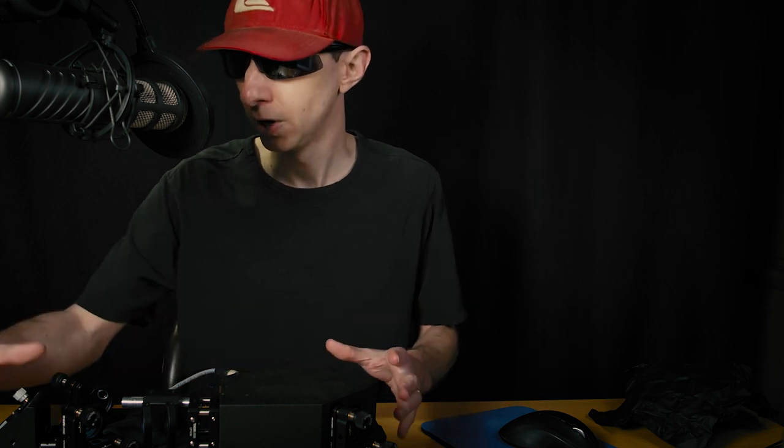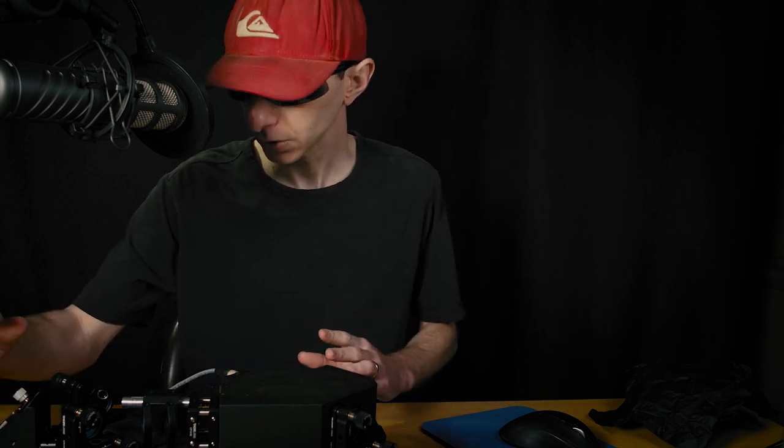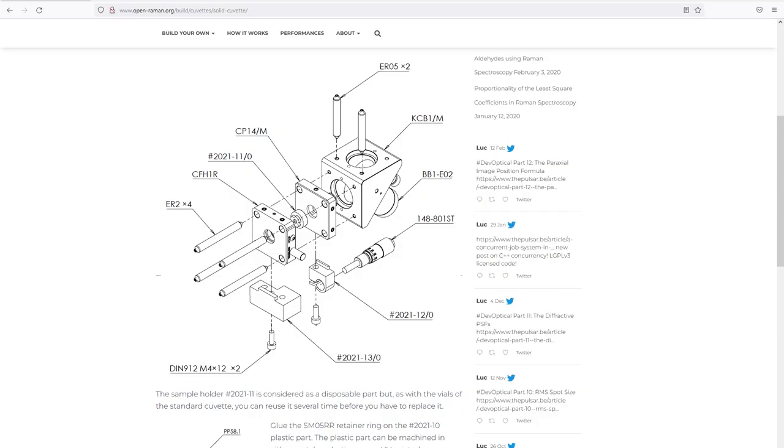We are at the point where the laser is aligned so now I've placed this cuvette. You can check the link down below to download all the CAD files to reproduce this system.